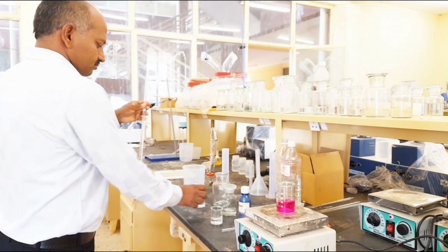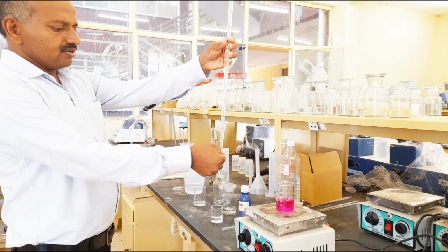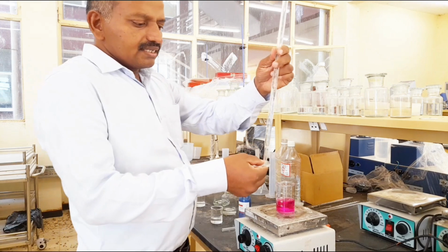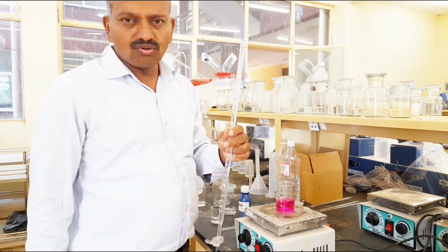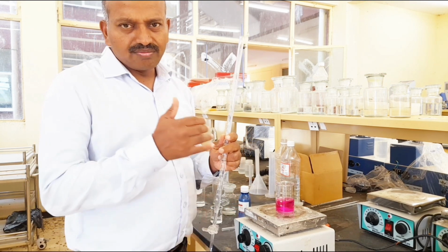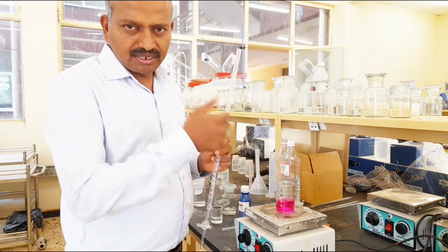Yes, so this is exactly up to the mark as it is filled. Now I have tied it with the solution mixture containing the phenolphthalein. This is the standard strength of hydrochloric acid, already standardized by means of sodium carbonate, as I told you before in part 1. Now the strength of this hydrochloric acid is 0.0434. From this we'll find out the amount of sodium hydroxide present inside the mixture, right?